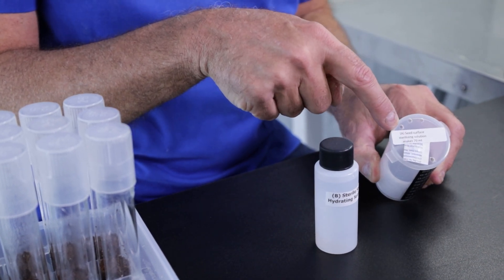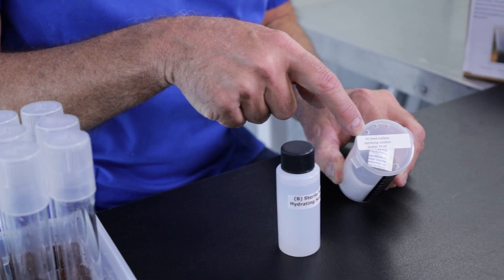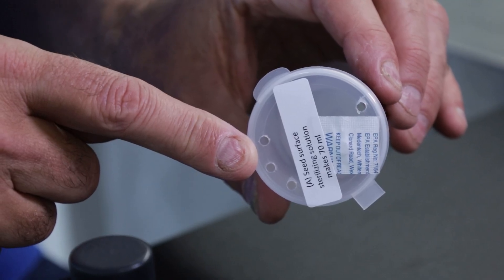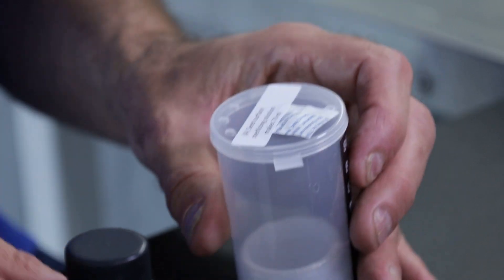Everything starts in the sterilizing bottle. I've got a thermometer on here so you can monitor the temperature. We want to be 80 to 82 degrees. And there is a tablet right there of dichlor sterilizer.